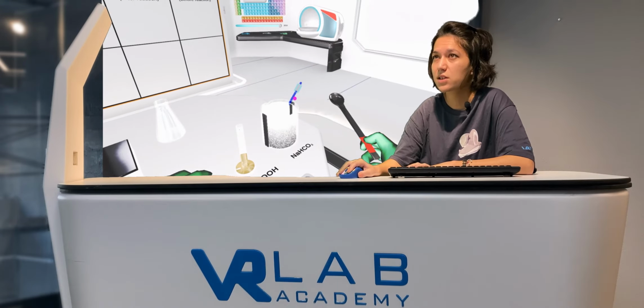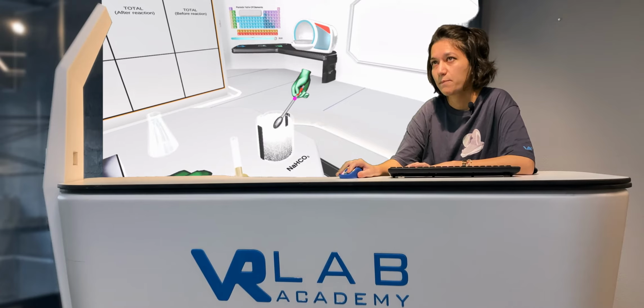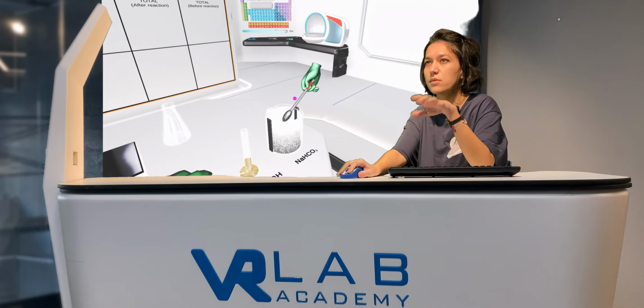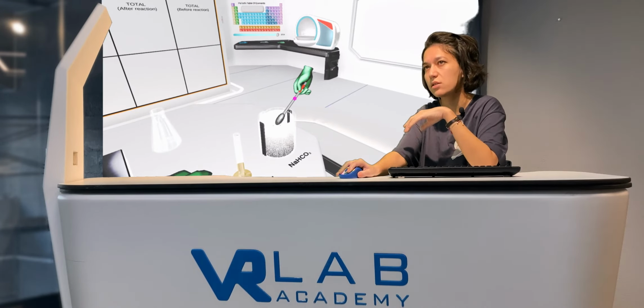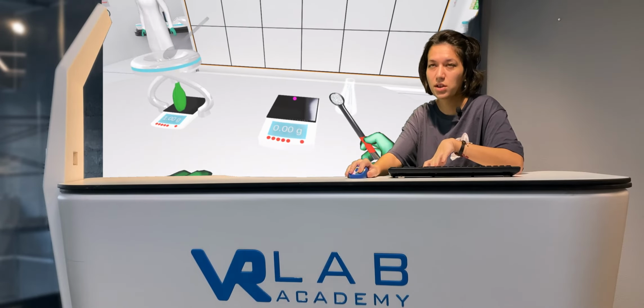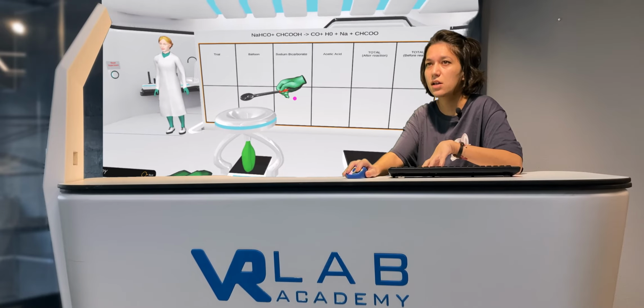I left click, take my spoon in my hand. I left click again in the blue region that is indicating where I have to click, and I right click, take my sodium bicarbonate, and put the sodium bicarbonate inside the balloon.